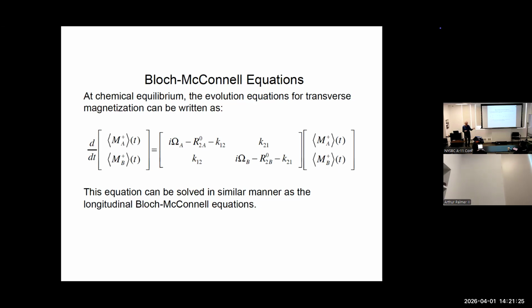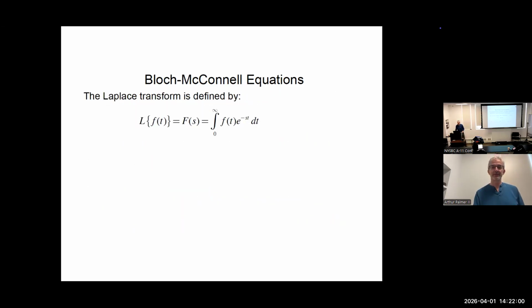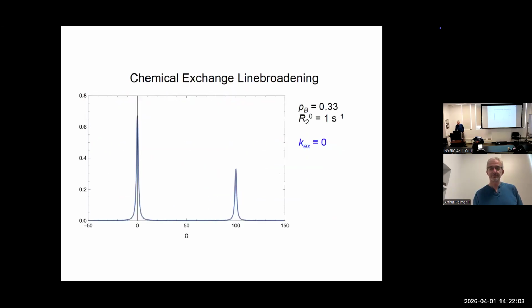And jumping back is ineffective because the rapid phase evolution in the other state means you jump back with a random phase, and those random phases cancel over the ensemble. Right, that was my picture of the vectors getting anti-opposed to each other. So we know this limit. The first thing we're going to see is broadening of the two lines, and the amount of broadening is by the jump rate out of each state. So there we see it.